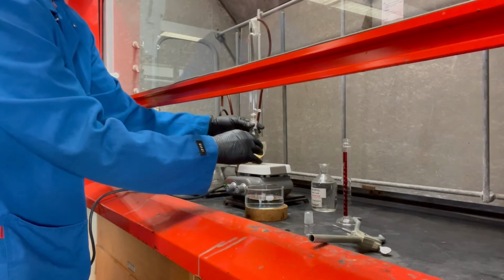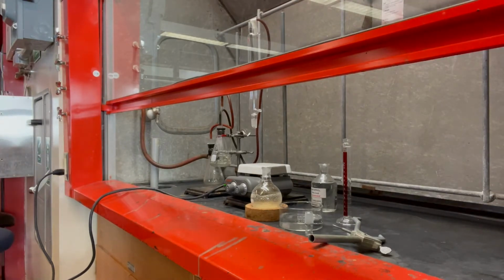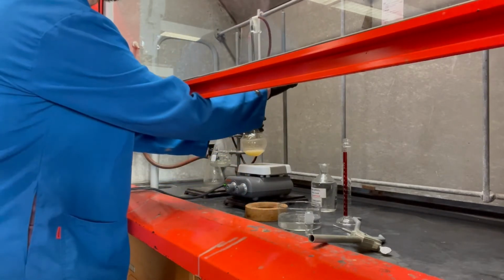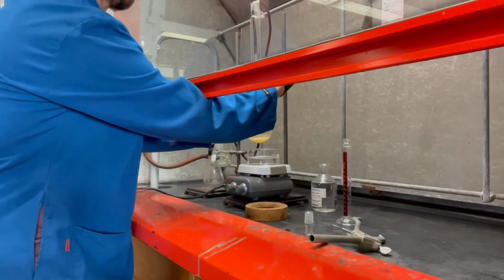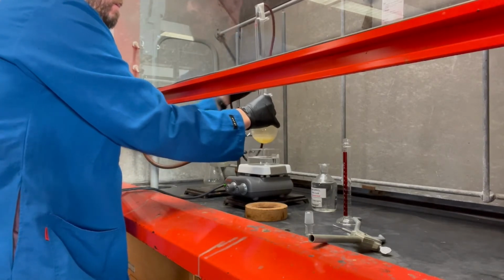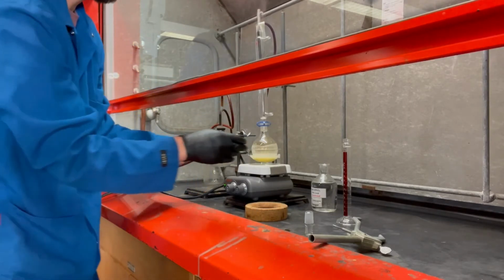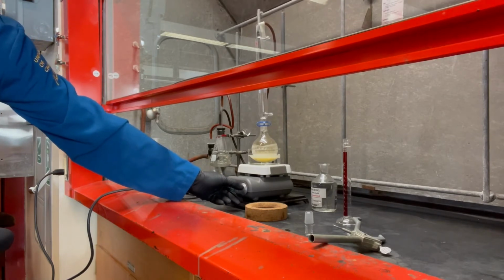I forgot to get my chem clamp. Boom. This guy going. Put that back a little. All right, now we're good to go, y'all. Want to make sure that your round bottom flask isn't touching the bottom, but it is submerged. And now I can go ahead and turn the heat on.